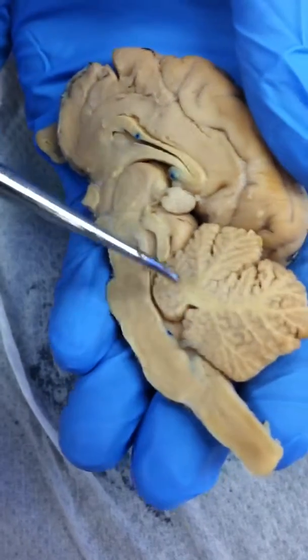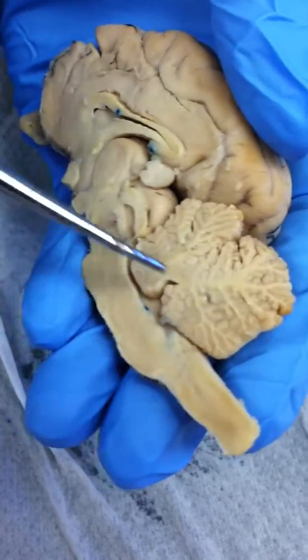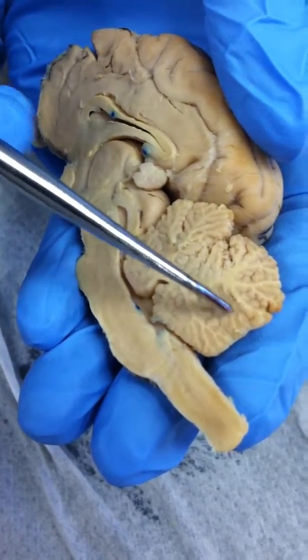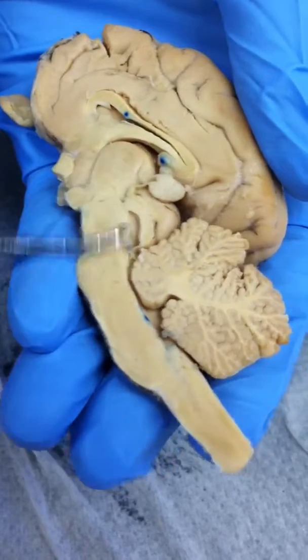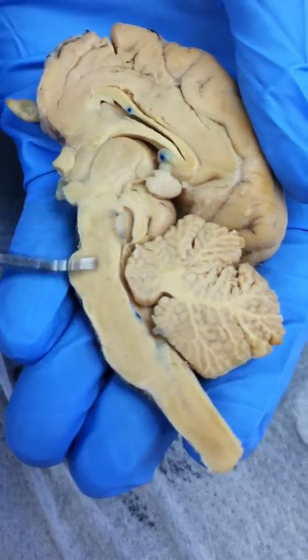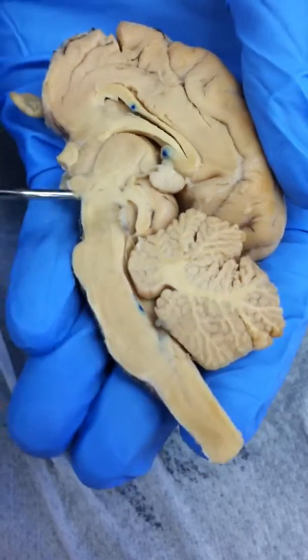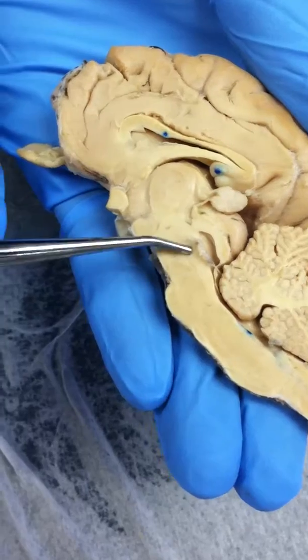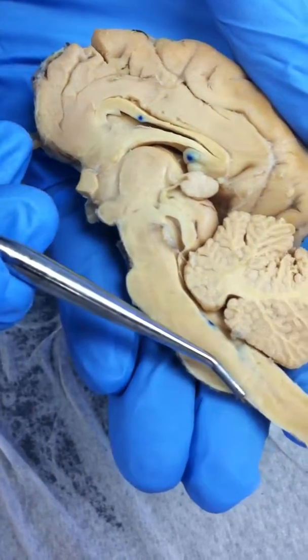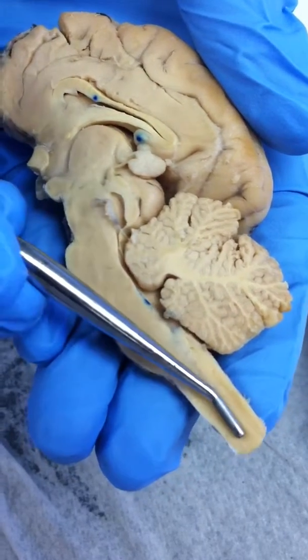Then we have the cerebellum. In the cerebellum, we have the arbor vitae, which is all the branches of the tree. Then the midbrain, which is all this. And then we have the pons, which is right before it extends out, the pons right here. Then when it extends out, medulla oblongata. And that's all this until it gets thinner, and then that becomes the spinal cord.